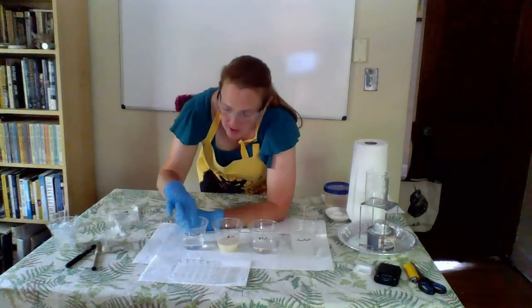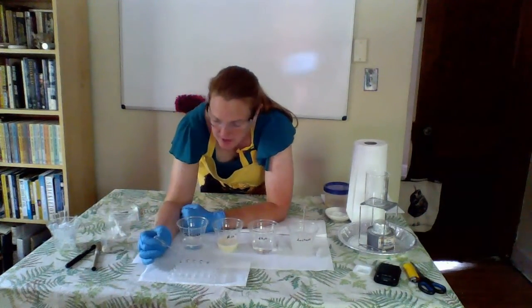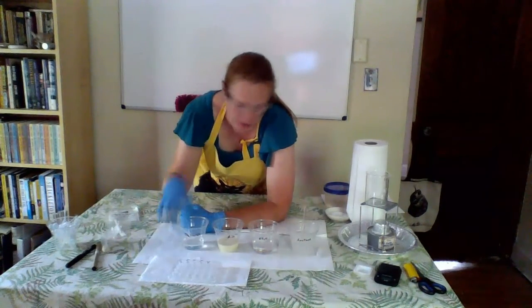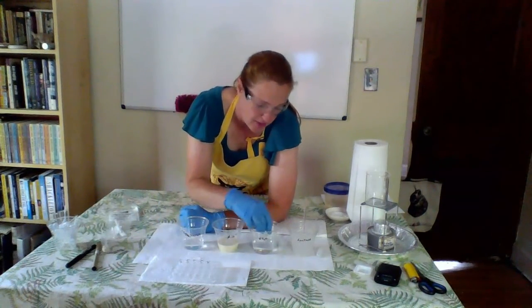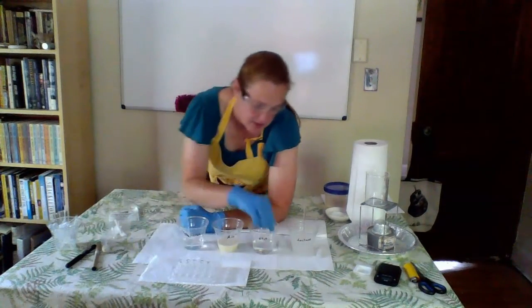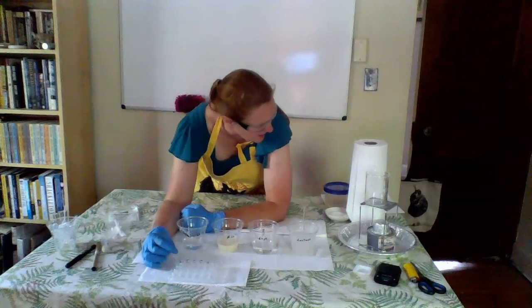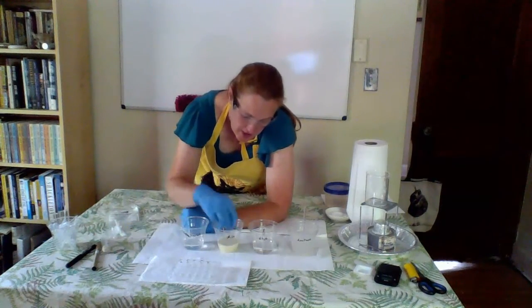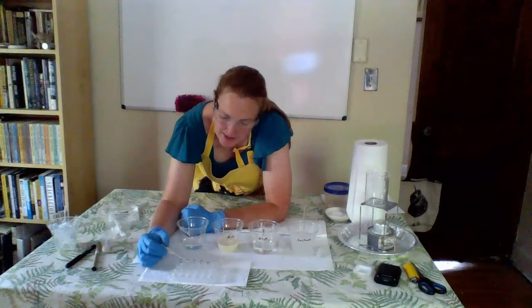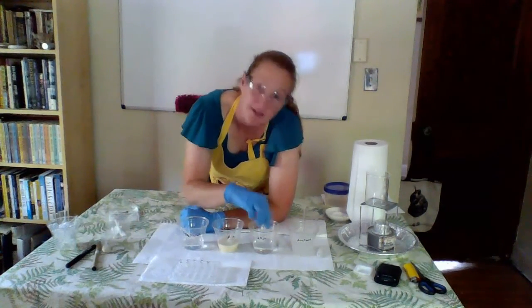So, into well A, we are going to put our 5% sucrose solution, 1, 2, 3 drops of the 5% sucrose, and we're going to put our 3 drops of distilled water. Into well B, we're going to put 3 drops of milk, and you'll notice that I just compulsively mix every time I grab a solution.